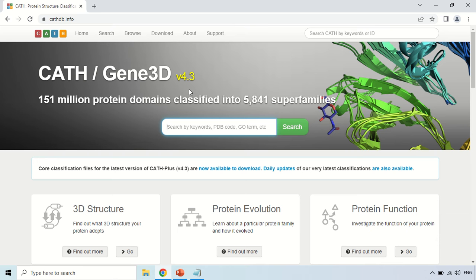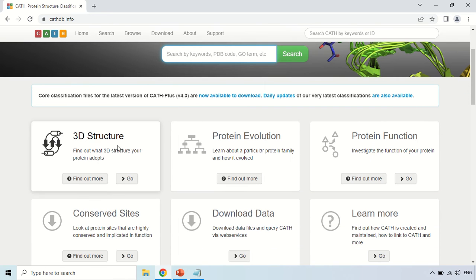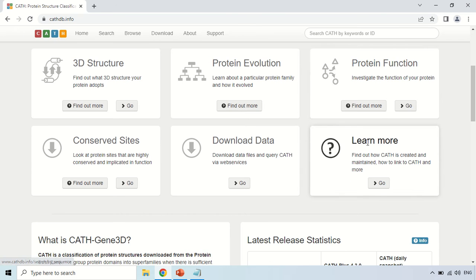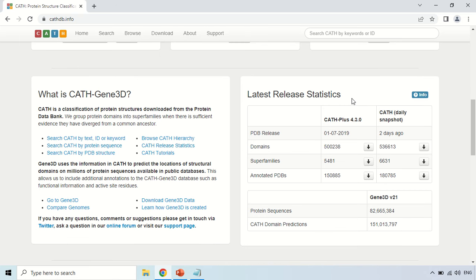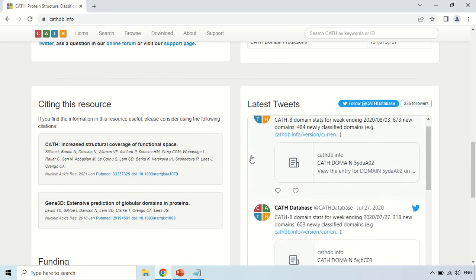Let me introduce the home page first. Here are the main sections: if you want to see the 3D structure of your protein, you can use this option. If you want to find out about protein evolution, this option is for you, and similarly this option is for protein function. If you scroll down, here is an introduction to how CATH-Gene3D works, along with the latest statistics of the CATH database and a news section.